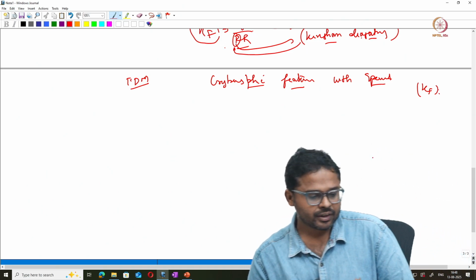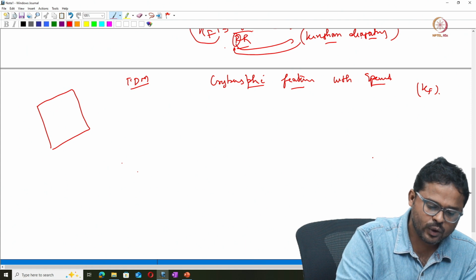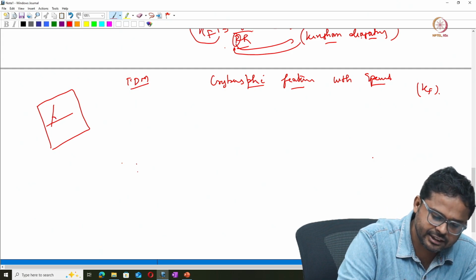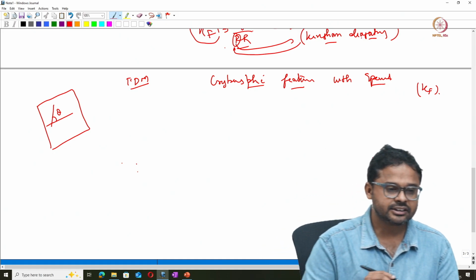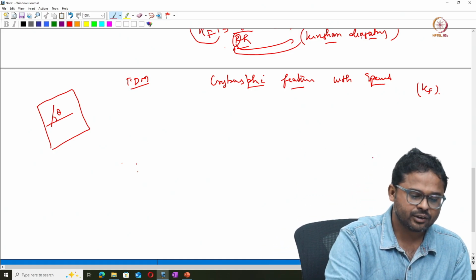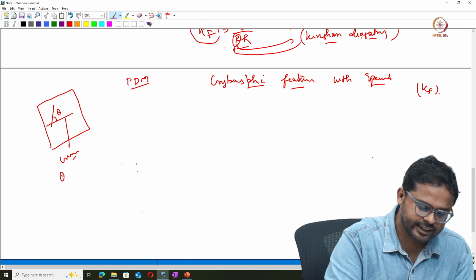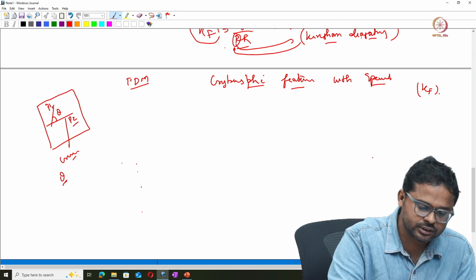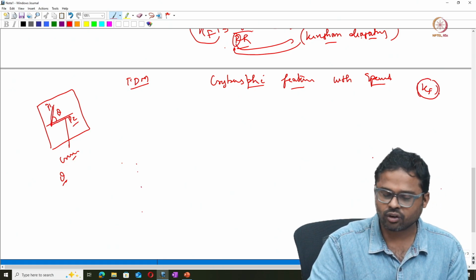Okay, for example, if you have an alloy, and you have two kinds of precipitates which are crystallographically on certain planes, and you know that the angle between these two precipitates is theta, which doesn't change due to the crystallographic nature of those precipitates. So you know that the theta is constant between precipitate 1 and precipitate 2. You can use this feature and the theta to calibrate the kf value for the optimum value.